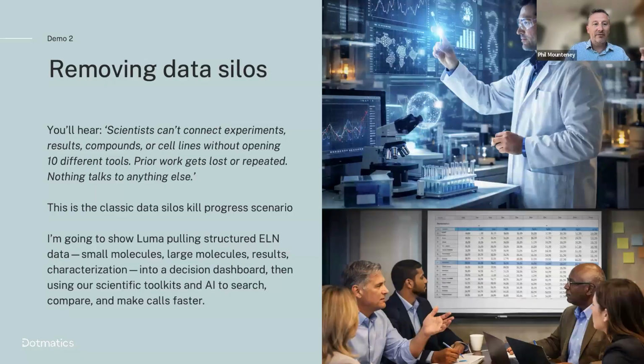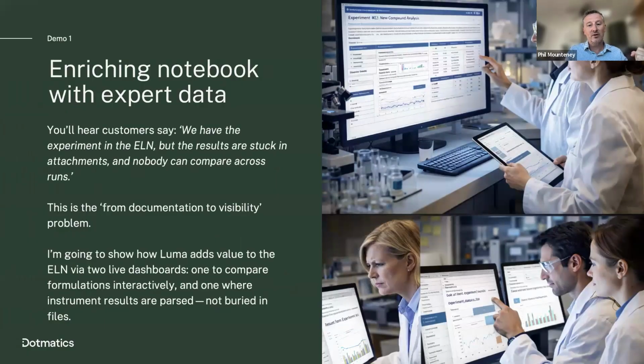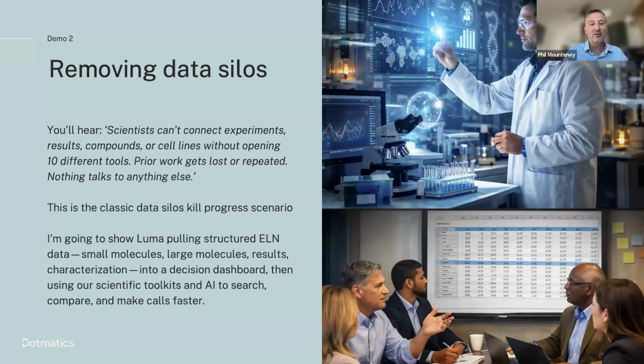So just to review the three workflows that I've shown you, I showed how you can use shared dashboards that use all of Luma's data connectivity to pull expert data into your notebook. This includes things like instrument data. I showed you an example from an instrument. It also includes other bits of software, for example, Prism data being pulled into your notebook. I showed you how we can use Luma to remove silos and to pull ELN data in and contextualize it with other bits of data that Luma has at its fingertips.